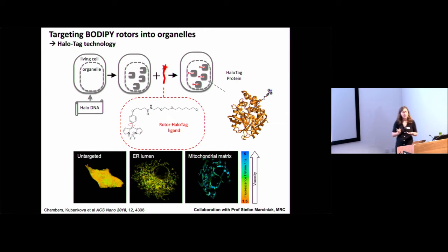And it turns out this is quite useful for looking at certain diseases. So earlier in the talk, we heard about alpha-1 antitrypsin. And so we use this particular ER rotor to study abnormalities in alpha-1 antitrypsin when it goes from the normal M form to Z-antitrypsin, which it turns out is accompanied by a large increase in crowding and viscosity.